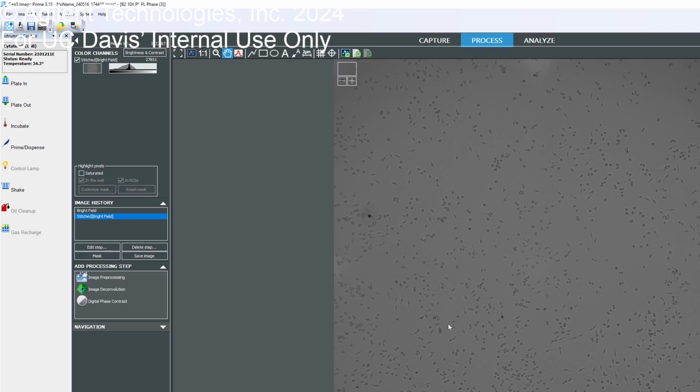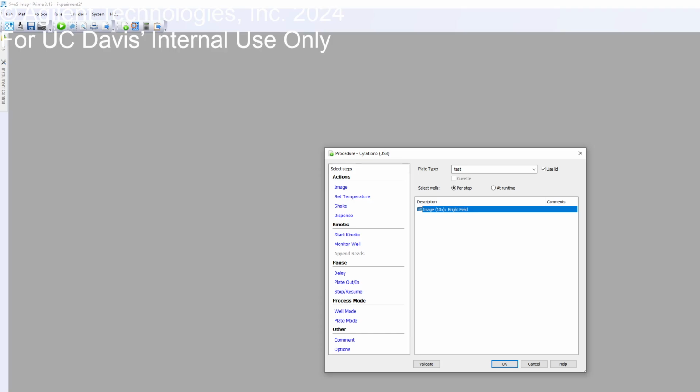And then if you right click on this and create experiment, you can alter it all, so you can set it up as well. Double click on this in 10x. Now if you wanted to do a Z-stack within the same montage, you are able to do that as well. So just turn on the Z-stack. How many slices do you want?